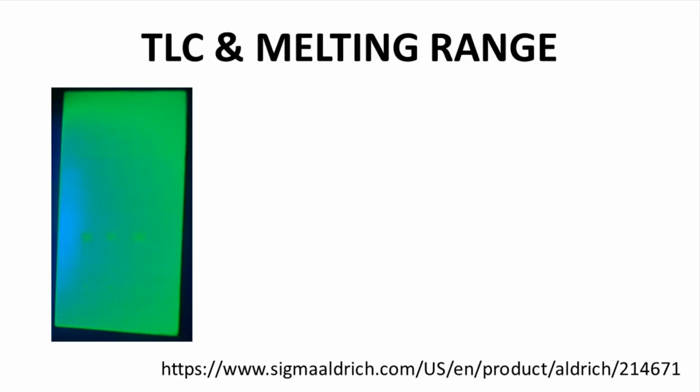Let's start with the TLC. Here to the left is the TLC plate of the product. The mobile phase for this TLC is 50% ethyl acetate in hexane. The spot traveled 1.8 centimeters.